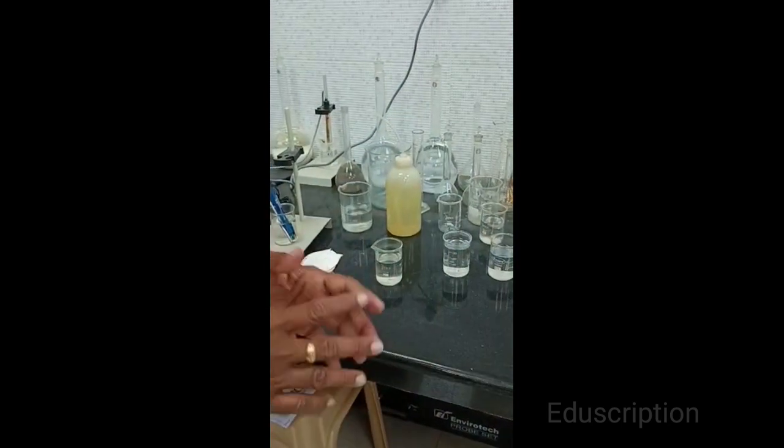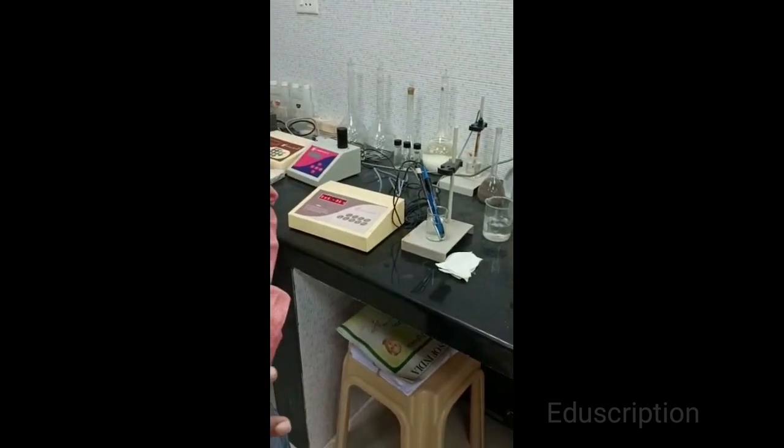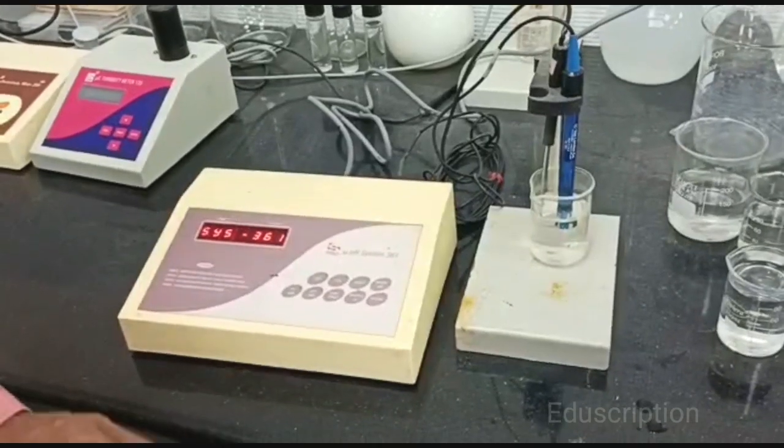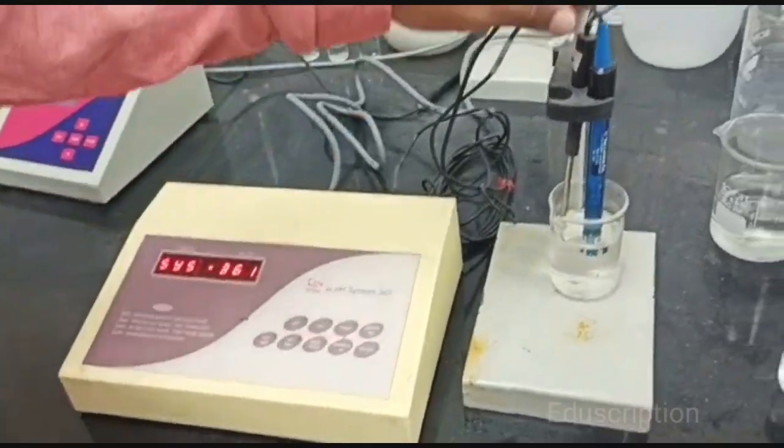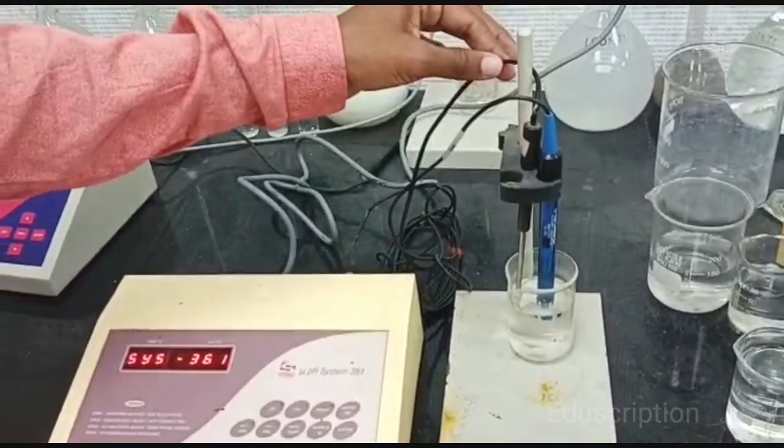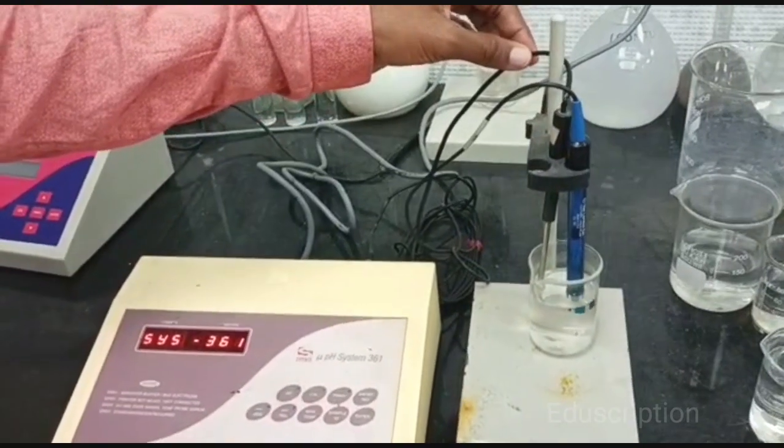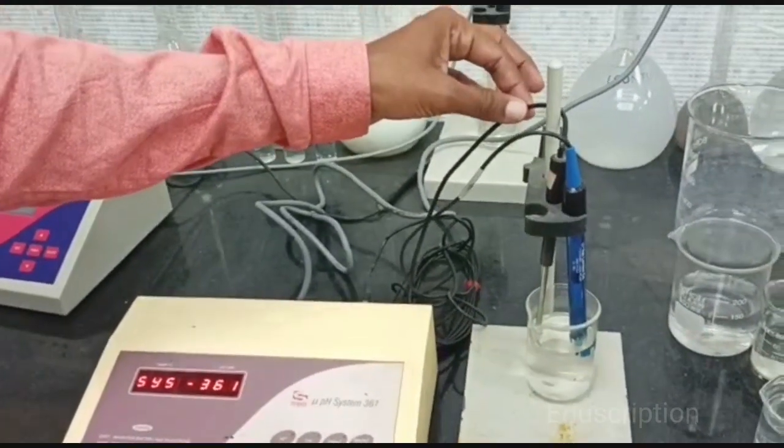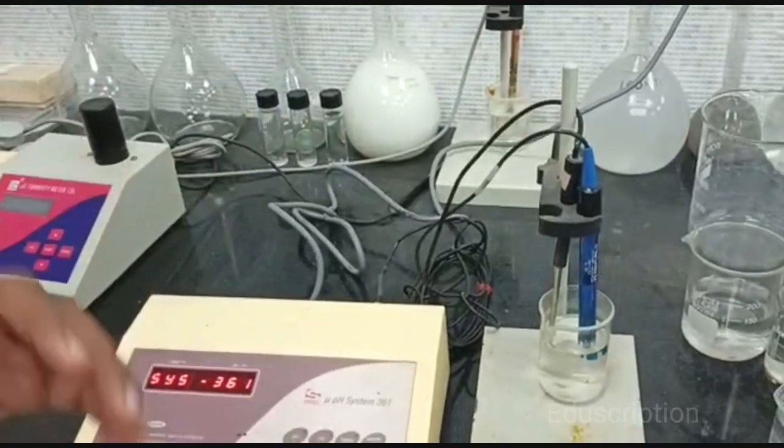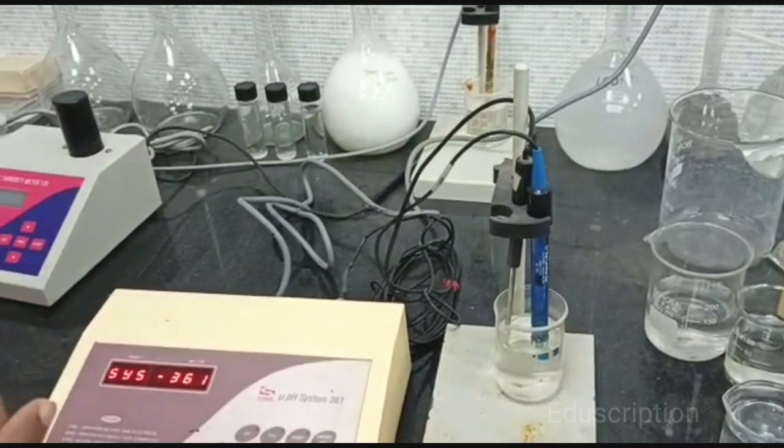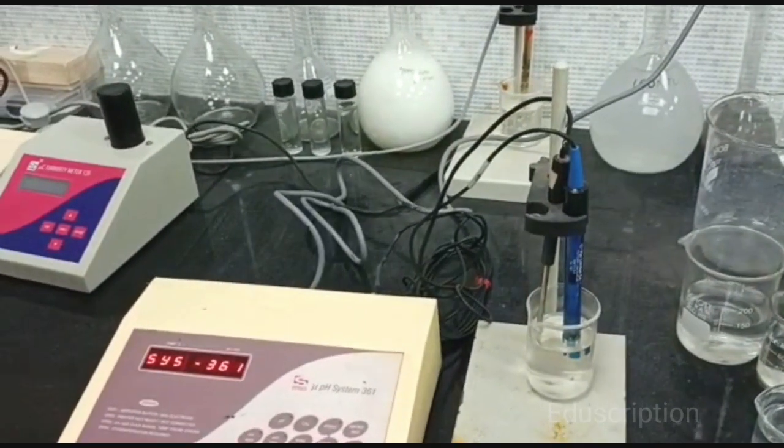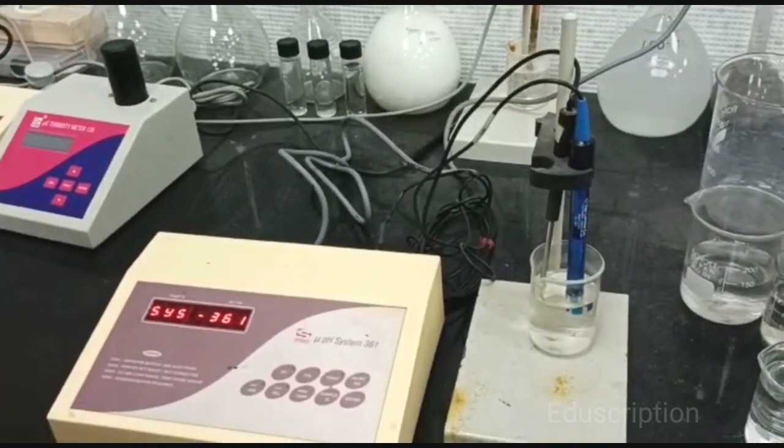This is colorimetric method. It will show or match the color only. But in electronic method we can detect the exact value. See, this is pH meter, this is electrode, this is ATC rod. ATC rod means automatic temperature control rod. While we are detecting the pH value, if you set this rod it will show the temperature also.